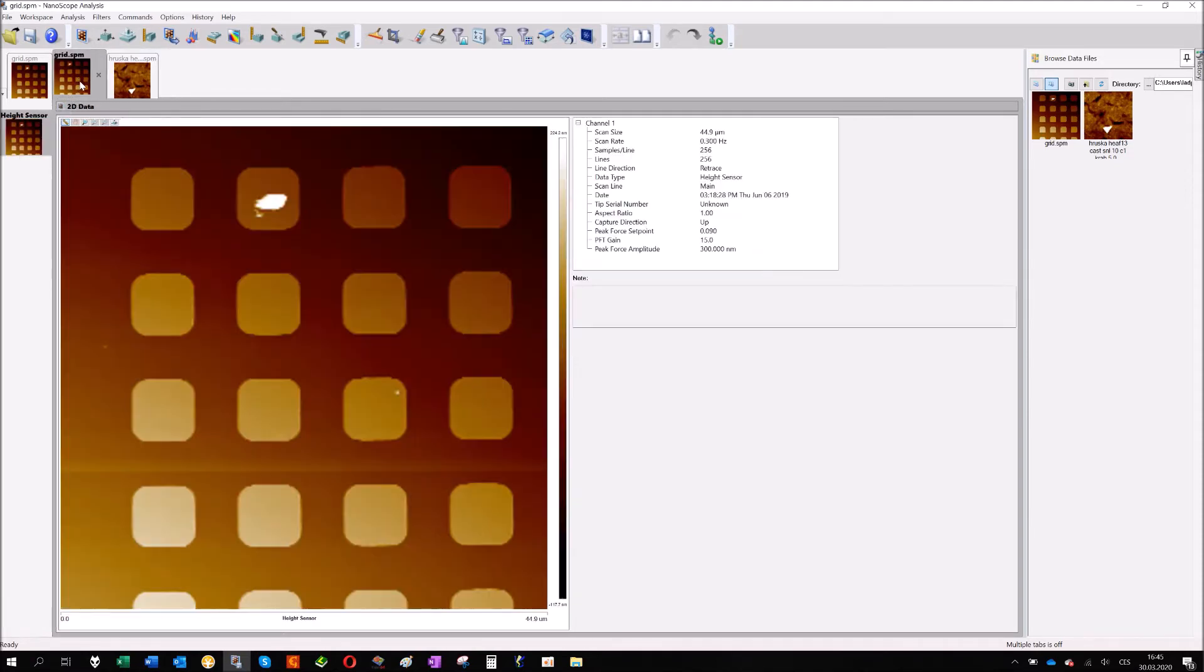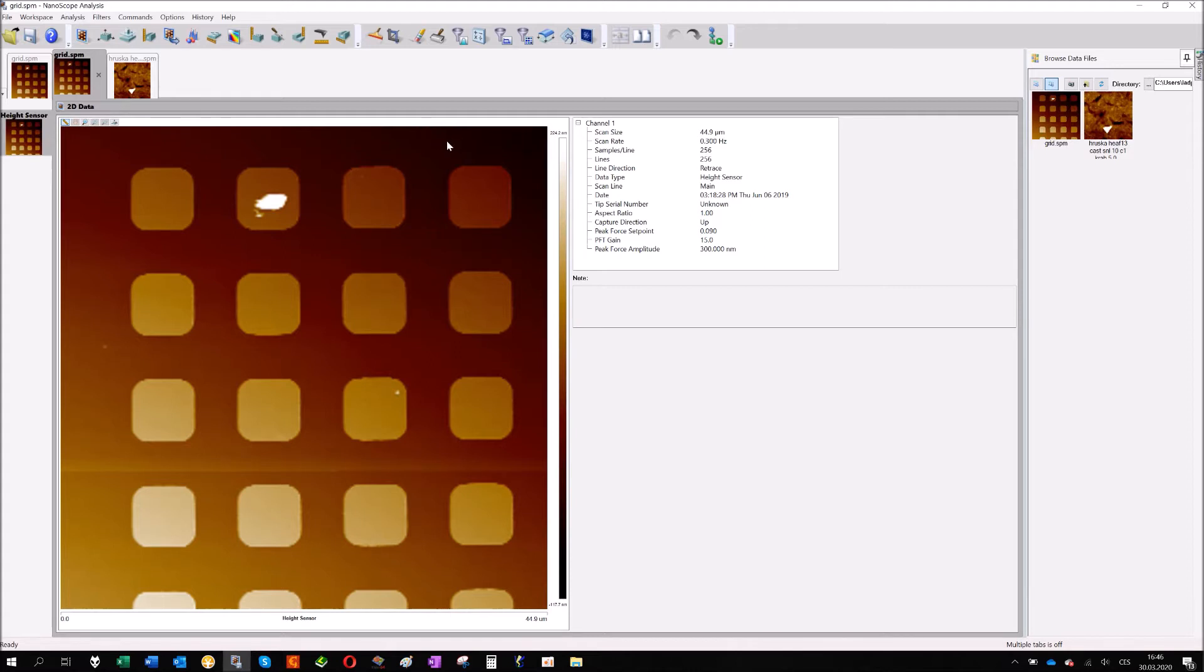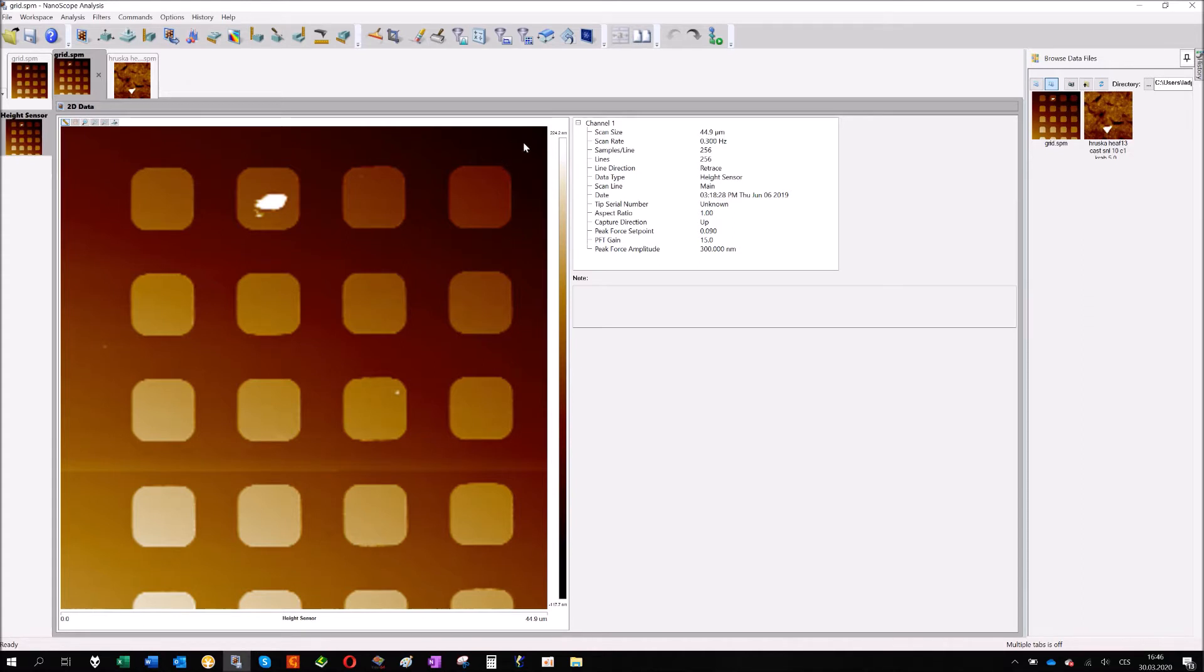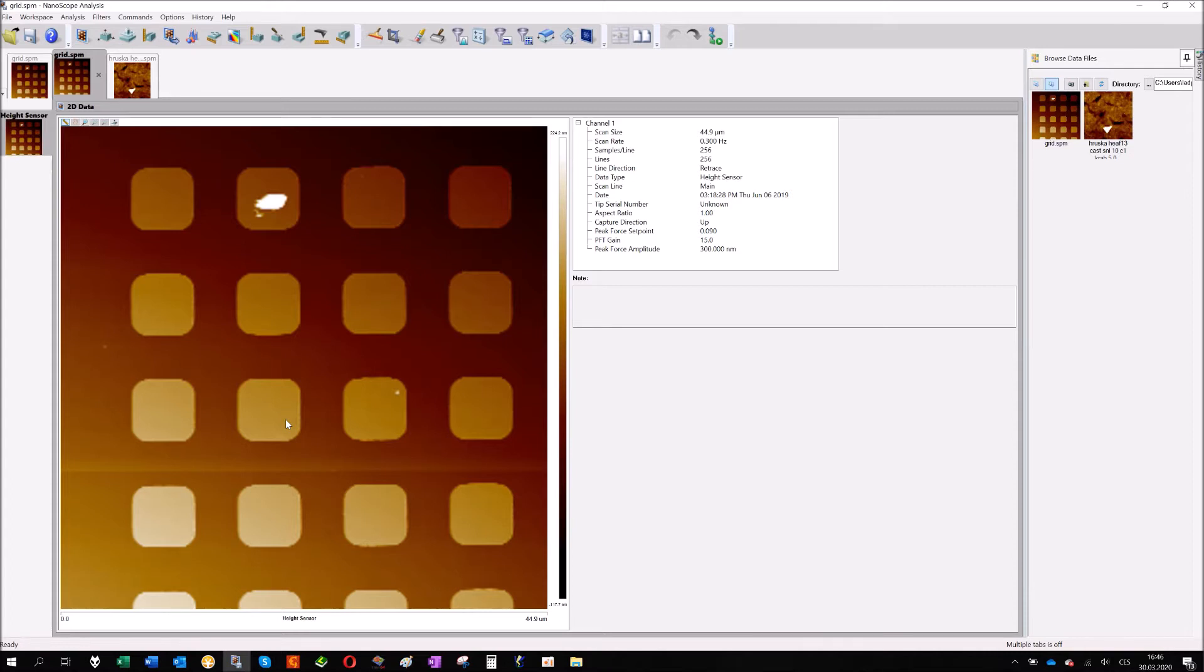That's enough for today. I will start with the tilt compensation. Each AFM image which describes topography has some tilt. You can recognize it very easily that you can see here one part of the image is much darker comparing to the opposite corner. The reason is that the sample itself or the scanner during the measurement has some tilt and it affects the results.